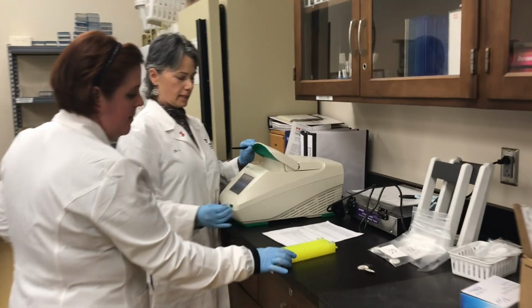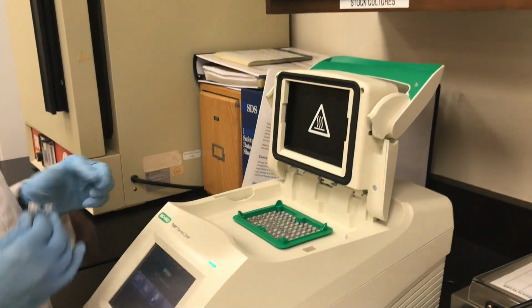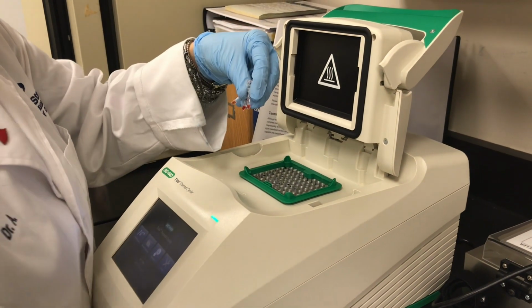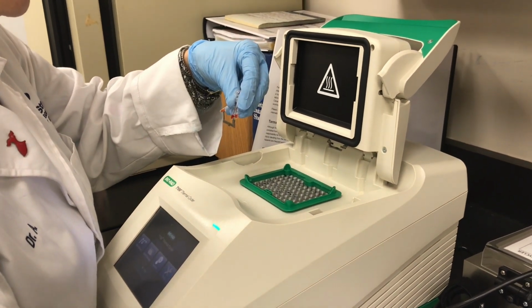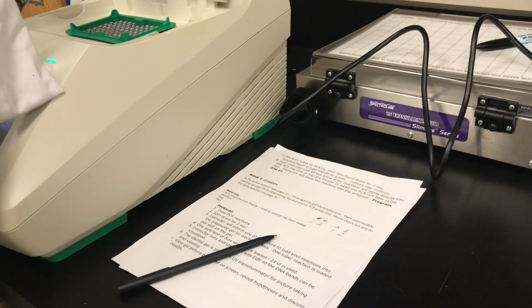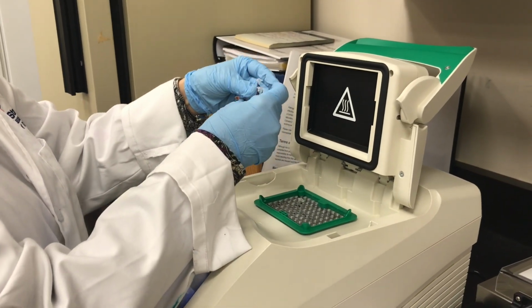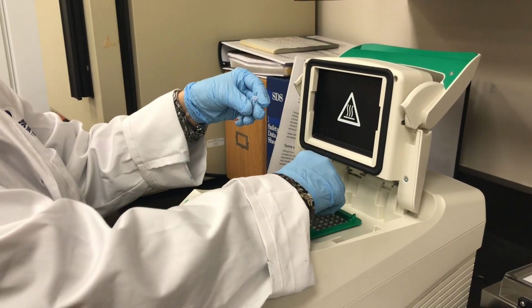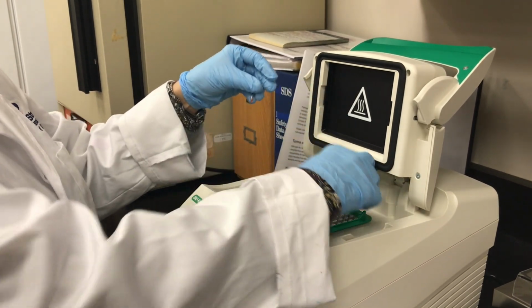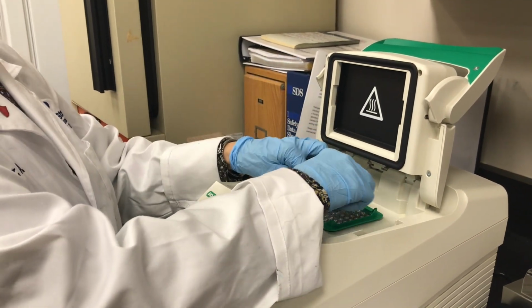So this is the thermocycler. I'm gonna put the little tubes in there. But I'm gonna make a plan here. Circle 1, circle 2, triangle 1, triangle 2, and put them in that order. Circle 1, circle 2, triangle 1, triangle 2.